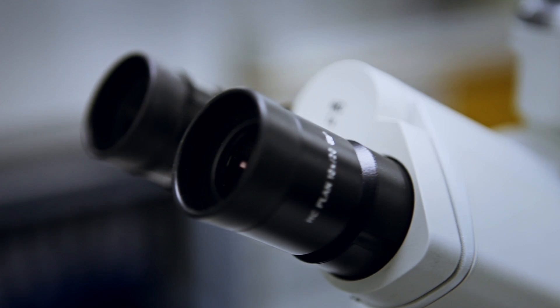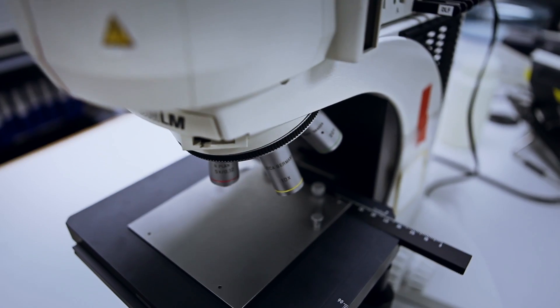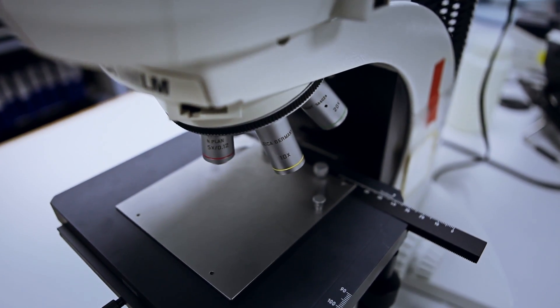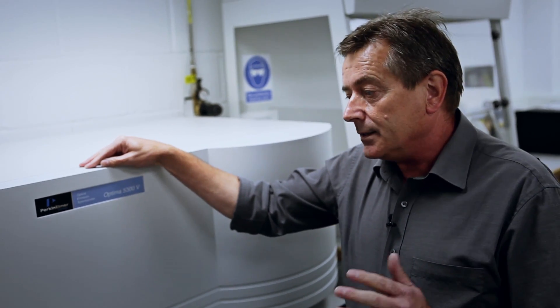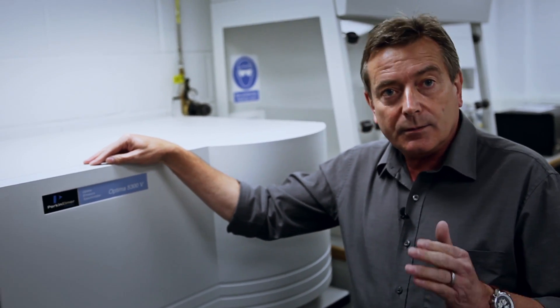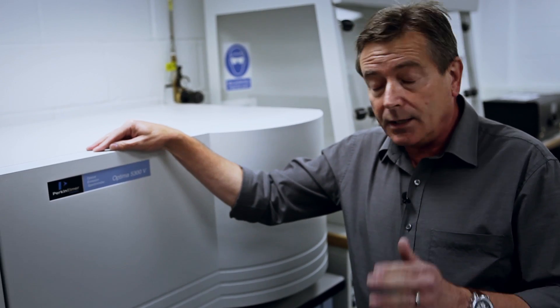It's predominantly kitted out with Perkin Elmer equipment. This is an optical emission spectrometer. It looks at metallic elements in oil. It can detect up to 23 metallic elements in oil under 8 microns.